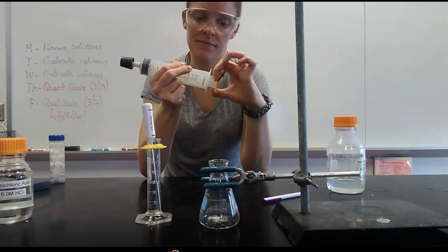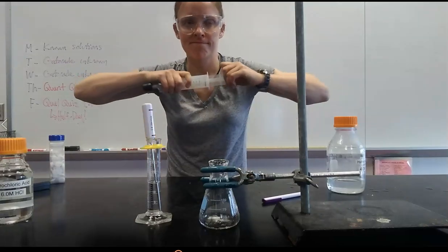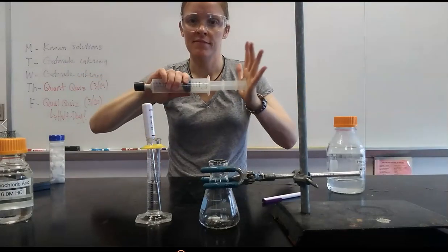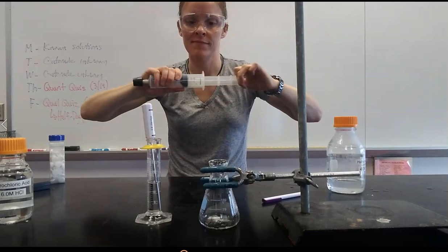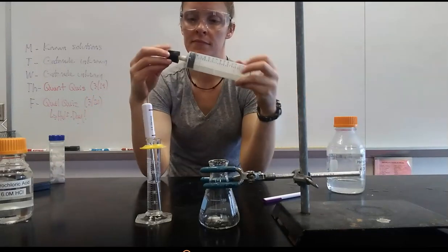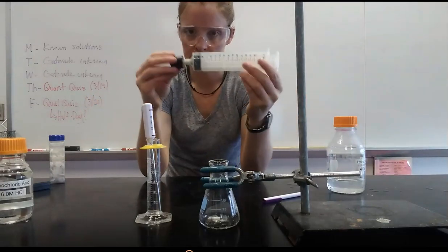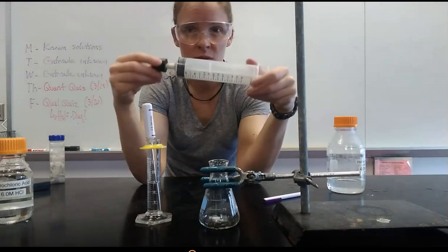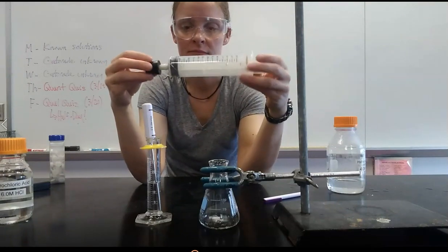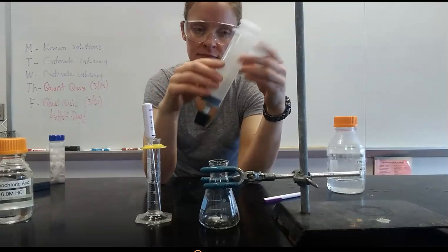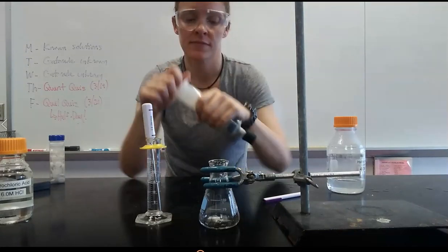Here's our gas collection tube. You can have the plunger move up and down on the syringe itself. As the gas is produced the plunger will move out. You've got a rubber stopper at the end. You really don't want to twist that around. That's bad. You're going to unthread it and then the gas is going to escape and you're going to be stuck doing this again and again.